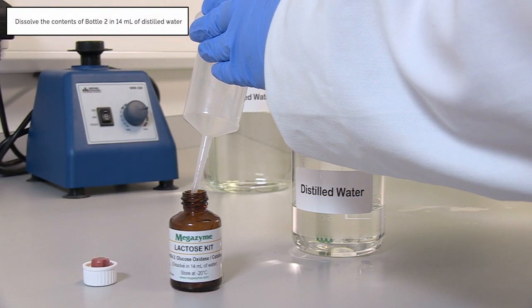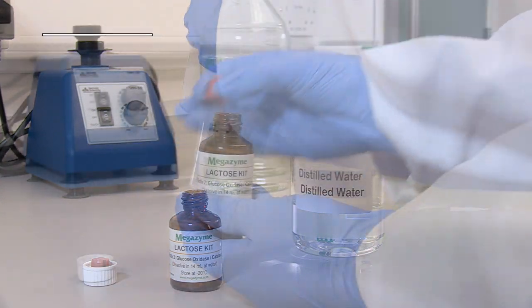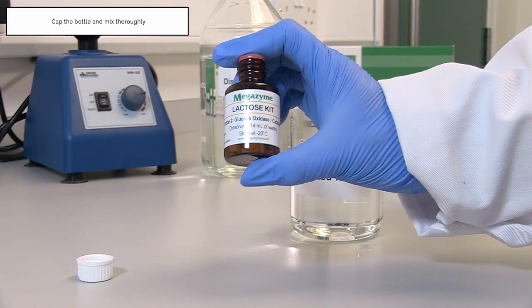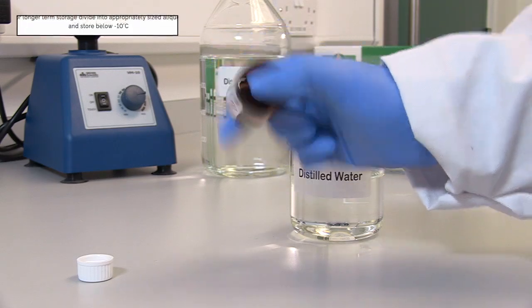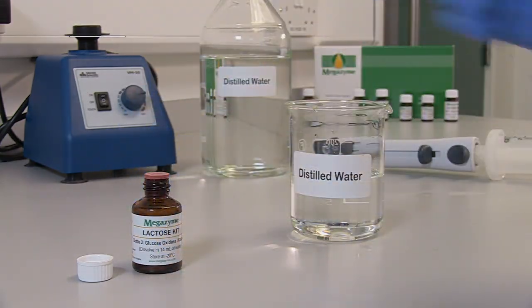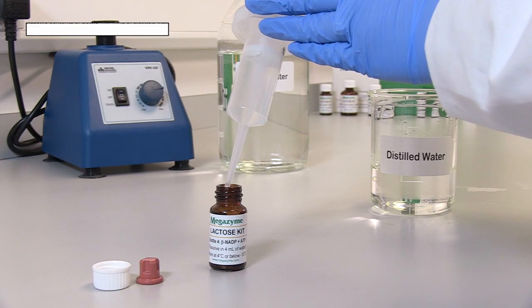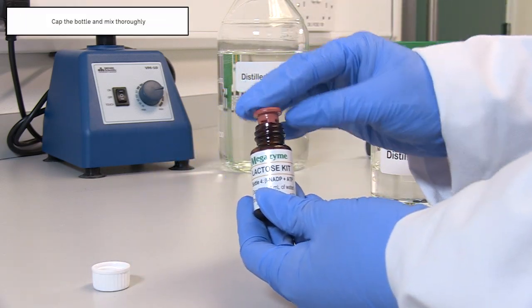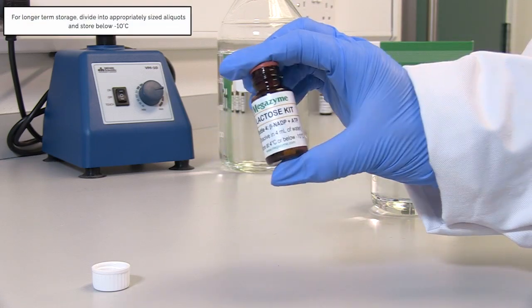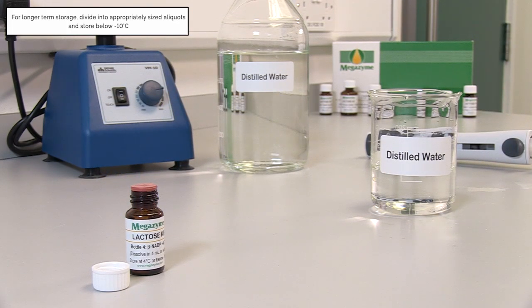The contents of bottle 2 are dissolved in 14 milliliters of distilled water. The bottle is capped and the contents are mixed thoroughly. Divide into appropriately sized aliquots and store in polypropylene tubes below -10 degrees Celsius. The contents of bottle 4 are dissolved in 4 milliliters of distilled water. The bottle is capped and the contents are mixed thoroughly to ensure complete dissolution. Divide into appropriately sized aliquots and store in polypropylene tubes below -10 degrees Celsius.